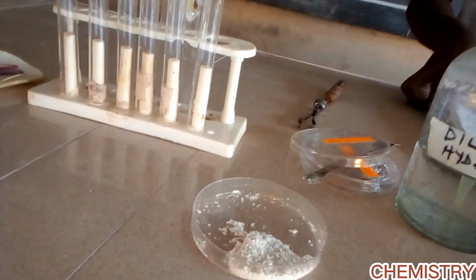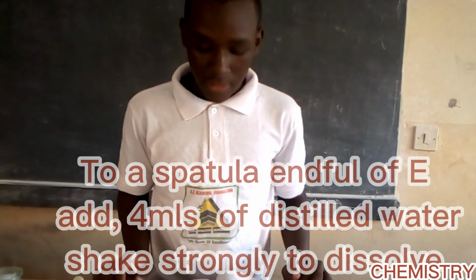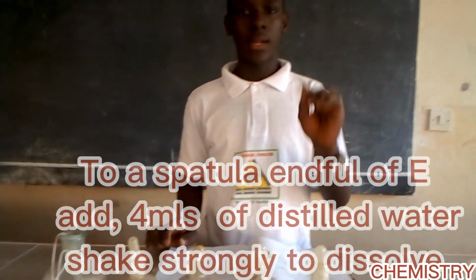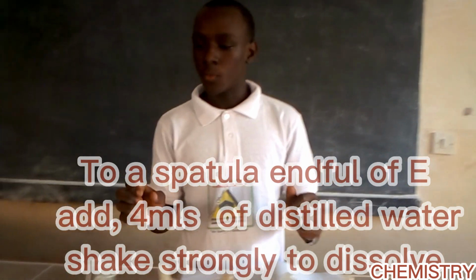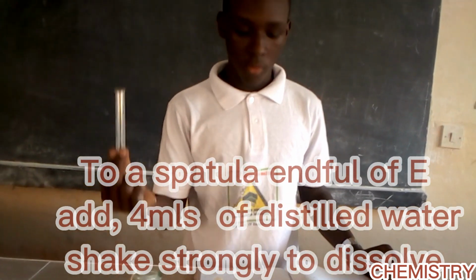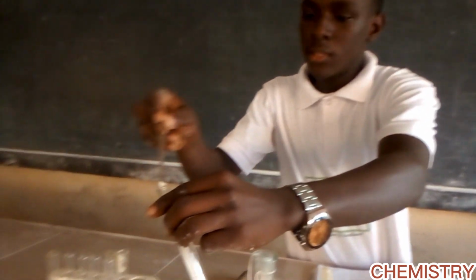So we are going to start our procedure, and they have told us to add a spatula endful of E in a test tube. The test tube you're using should be purely clean, without any other chemicals or substances in it, so that you can attain clean results. This is our clean test tube, and this is our spatula. We are going to get 1 spatula and put it in a clean test tube.